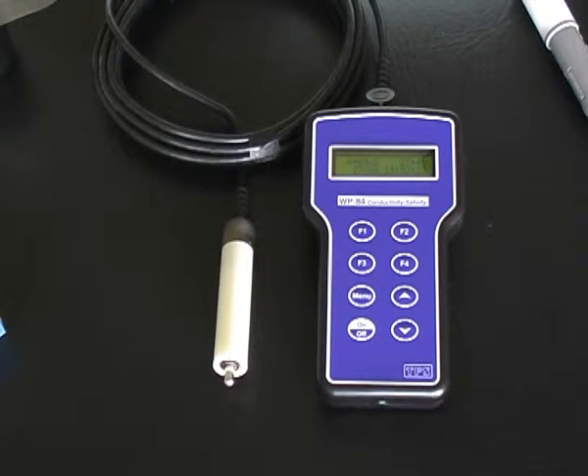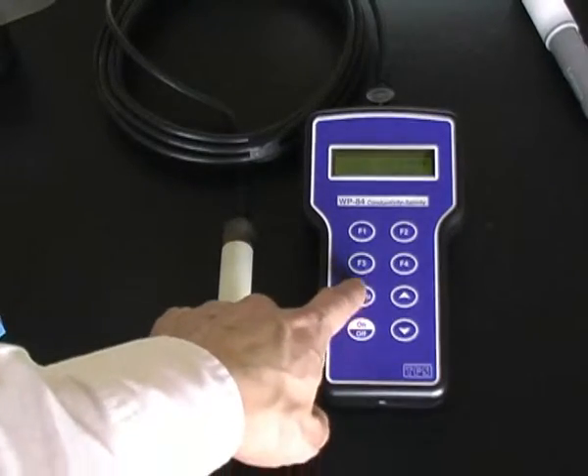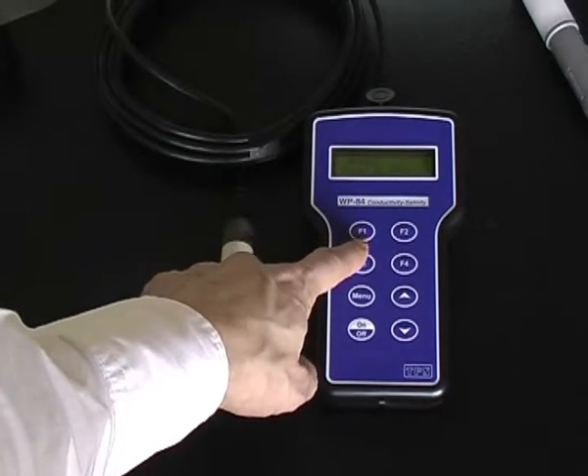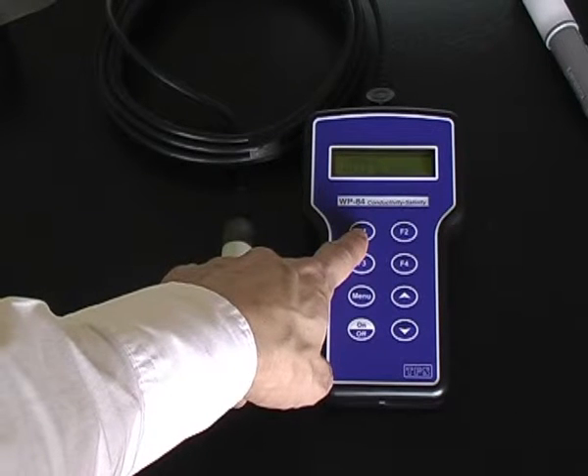To calibrate the TPS-WP84 conductivity TDS meter, the procedure is the same as the 90FLT. Press Menu, F1 for Cal, F1 for conductivity, and then press F1 to accept calibration, instead of the Enter button.